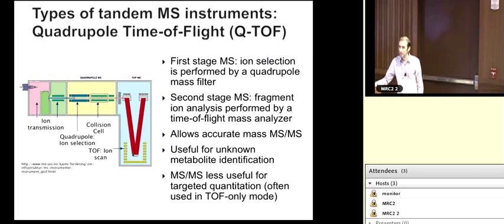Similar to what's happening in the area of genomics, it looks like we're experiencing something similar in metabolomics. Whether it is an exome capture, an exome, or a gene panel, there are no two gene panels that are alike. The same thing is happening here for the NIH-funded core labs, like Michigan's, as well as commercial vendors like Metabolon. The platforms may look comparable on the surface, but there are probably significant differences. And for an end user, a non-core person, how do we make the best choice?